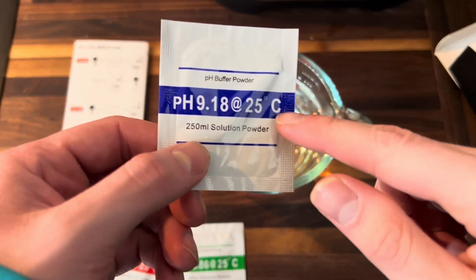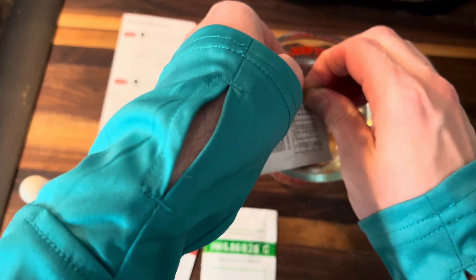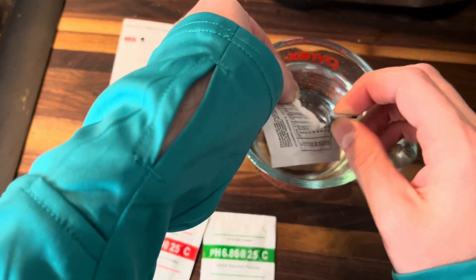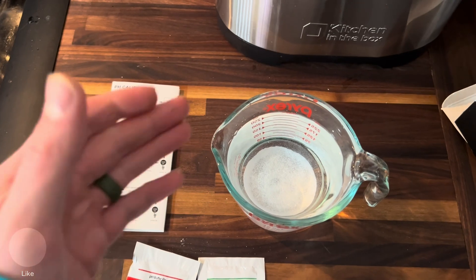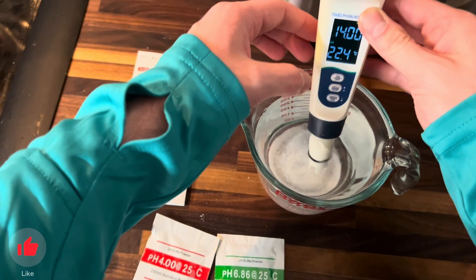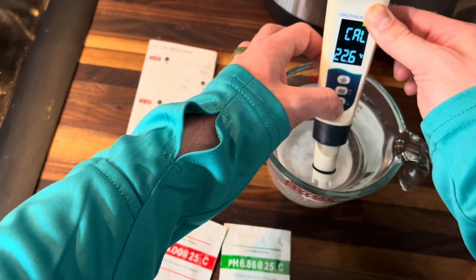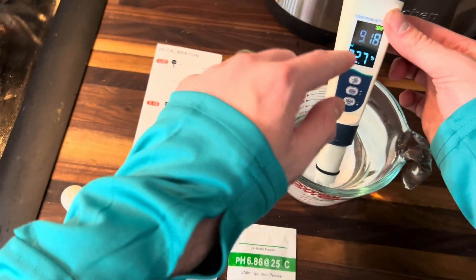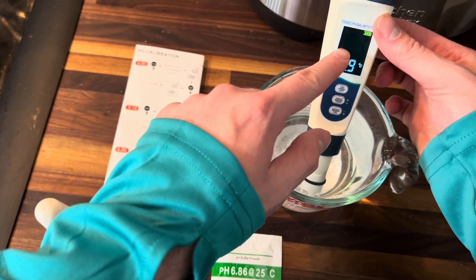We have some fresh water. Now we're going to go ahead and do the 9.18. Go ahead and tear that off and pour it into the water. Now that this is mixed in, we can do the next mode of calibration. I'm going to hold down mode one more time — this is for the 9.18. As you'll see flashing on the screen, it's calibrating for 9.18.